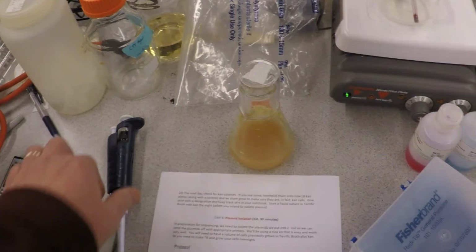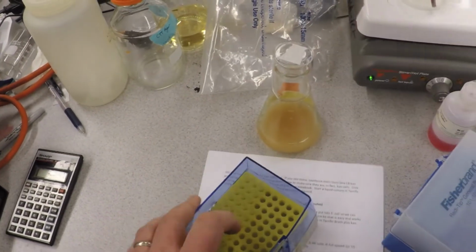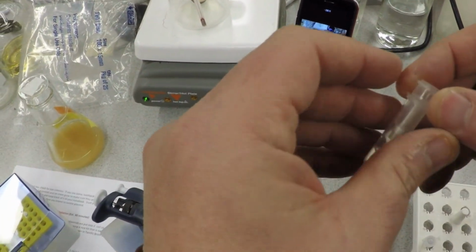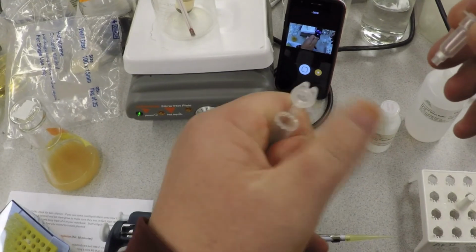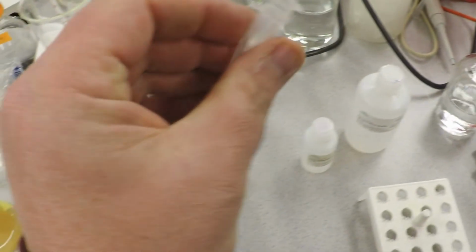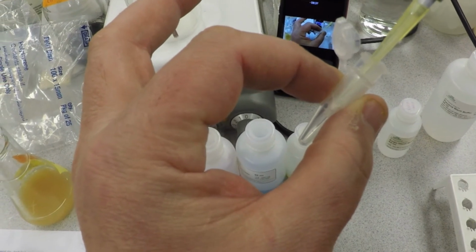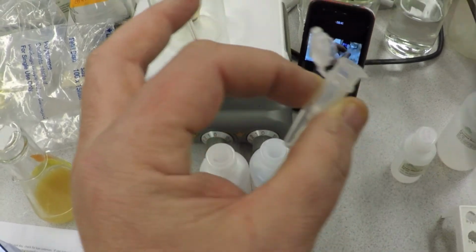I've got my littler pipette here, set at 30. Kind of get it ready. So there we go. So now we can toss that. We'll stick this into our new tube. And now we're going to add a low ionic strength buffer to this, 30 microliters of it. And when you put this on here, just make sure you don't touch the matrix. Never touch the matrix, but you just plop it right on top. There it goes. Nothing magic again.